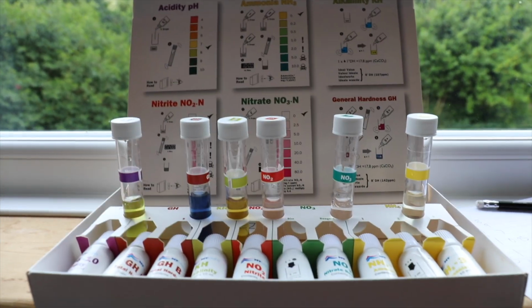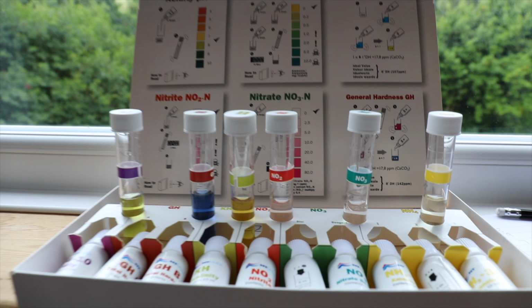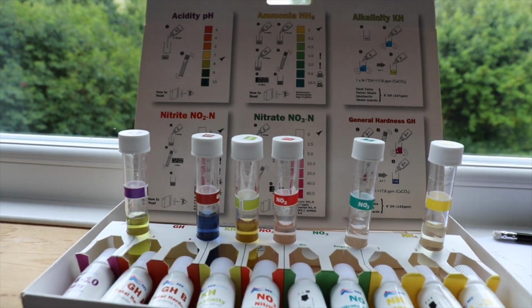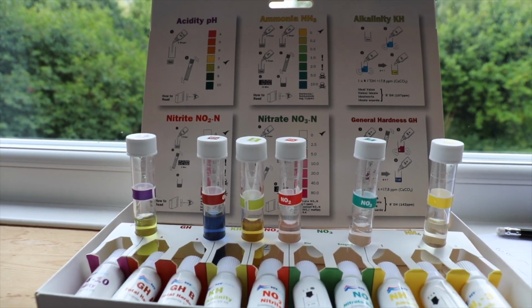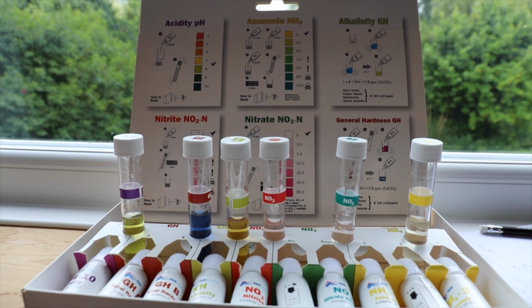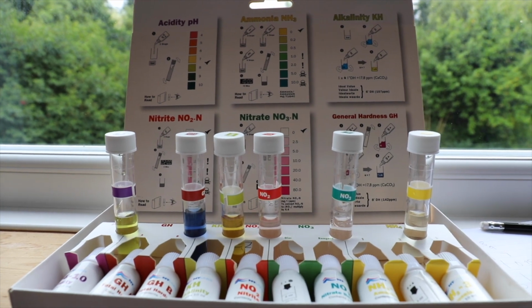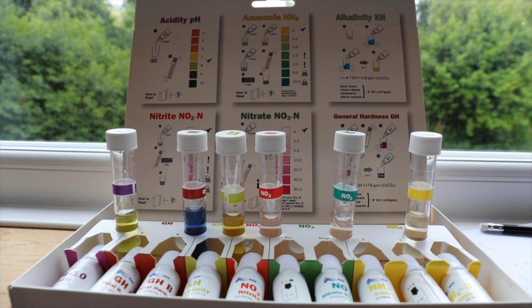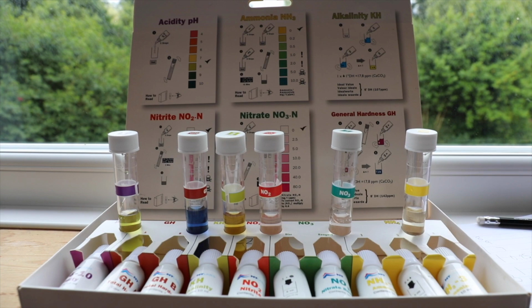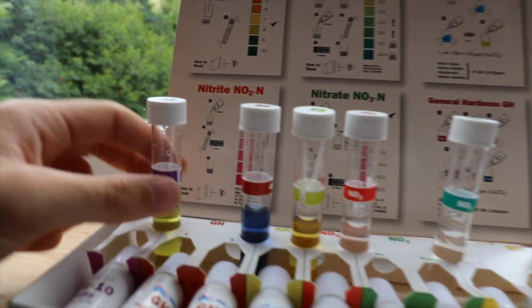As I say, it's indoors for today because the weather is absolutely appalling. So I saved you the boring part of watching me drop all the little things into the little bottles there. Now most of the readings seem to be okay at the end of the, well, I need to wait 10 minutes for, I think it's the NO3 and the NH3, so that'd be the nitrate and the ammonia, and then once that's done, I can let you know the results of what I got.